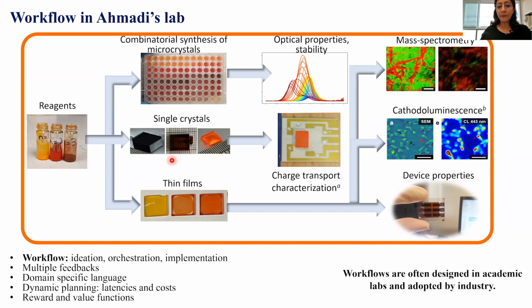Each of them has different proxy measurements. If they are single crystals, we have a different proxy measurement. If they are thin films, we have a different set of characterization suitable for thin films. However, the most important point here is that first of all, we need to define a language in every workflow, and the language that I define for my workflow is different from the language that other labs, even those working on the same type of materials, define.